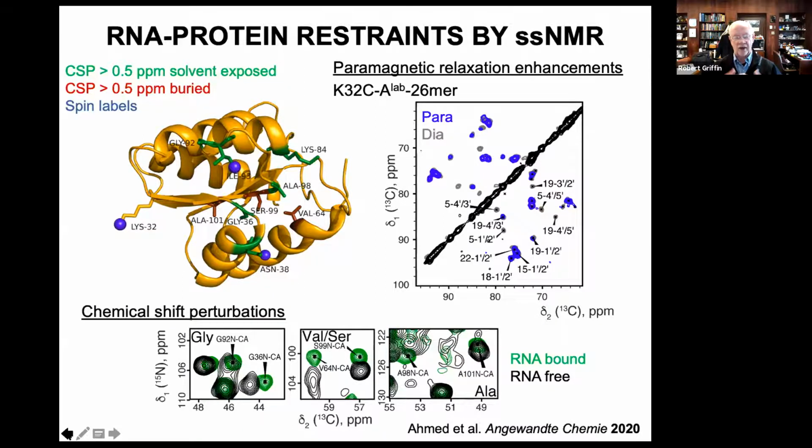Anyway, at 3 angstroms you should be able to see the carbon-nitrogen. Yes, 3 angstrom we see, but they are more like 3.5 or further, the carbon and the nitrogen, and there we have difficulties to see them. We see some, but not all of them. And for sure, we had much more luck with nitrogen RFDR, for the one where both the donor and the acceptor protons are on nitrogen.